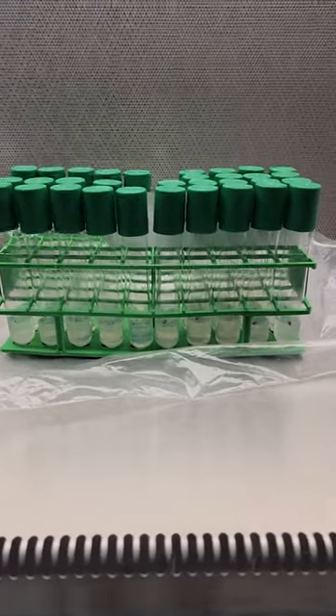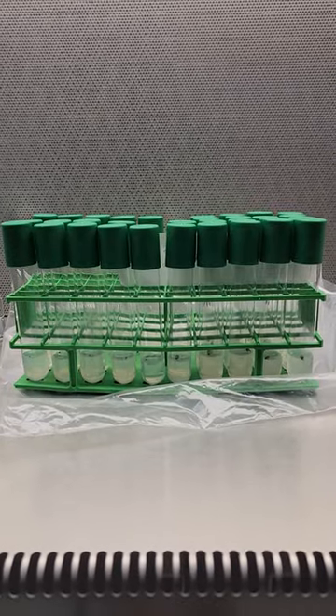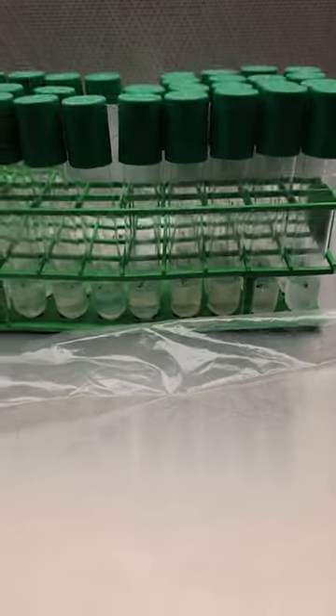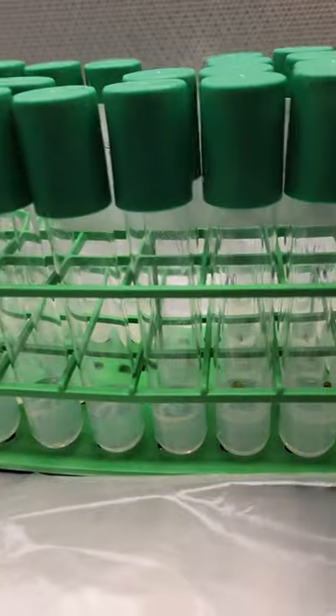All right, here are my Ariocarpus fissuratus seeds in tissue culture. I got to speak up above this flow hood — it's pretty loud. Show you guys a couple of the coolest ones. I think this is the biggest one so far. A lot bigger than what I'd expect for 30 days.